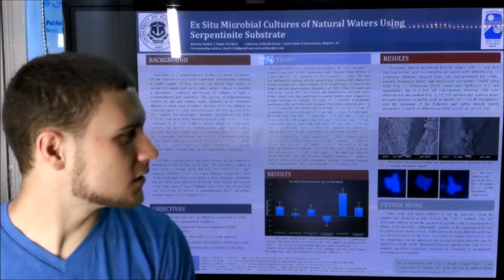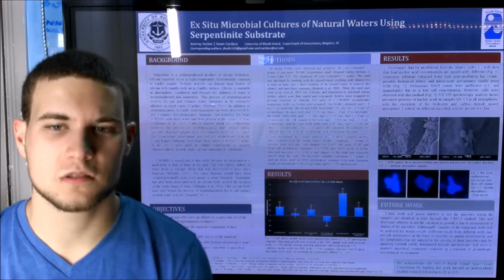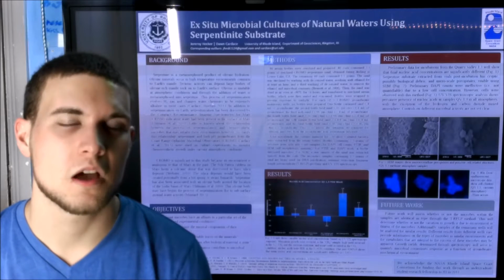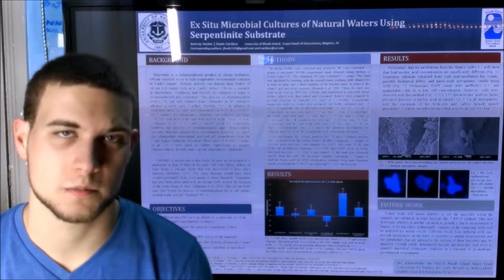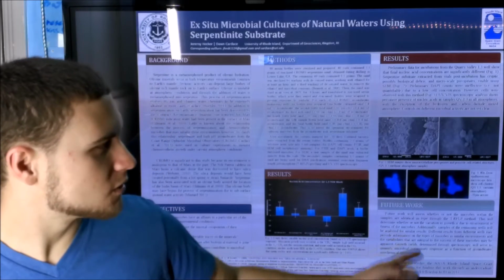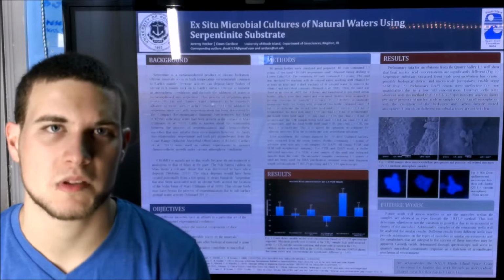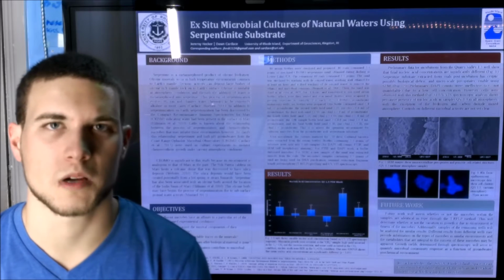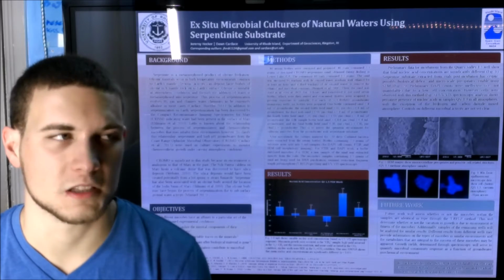The SEM images here may show microbial adhesion to specific minerals. We think they might be utilizing iron-rich minerals for metabolism. Further research will be used to determine if that is the case. The 3 images below that are images using DAPI stain and may show microbial communities or microbes encapsulating clay minerals for metabolism.